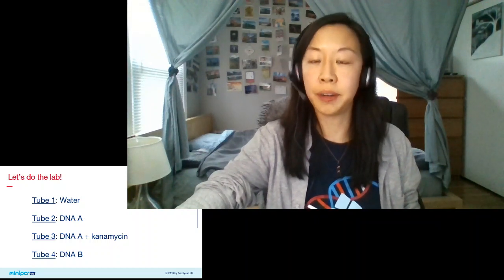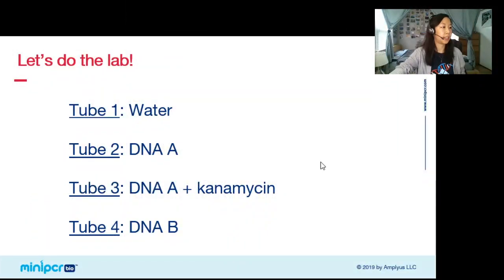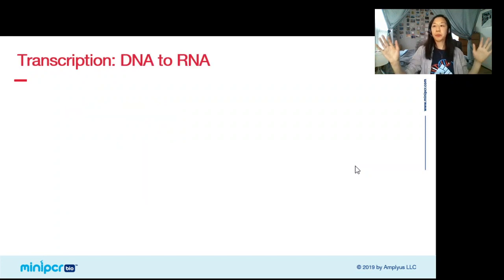And that's it. Alright, so we're going to let the tubes incubate there, and while the tubes are incubating, as promised, I'll take you through what's going on. Alright, if we go back to our slides. So, going back to our analogy, when you want to make a recipe, first you need to look it up in your cookbook and copy it down on a piece of paper. When you do that, you are transcribing the recipe, a process called transcription.